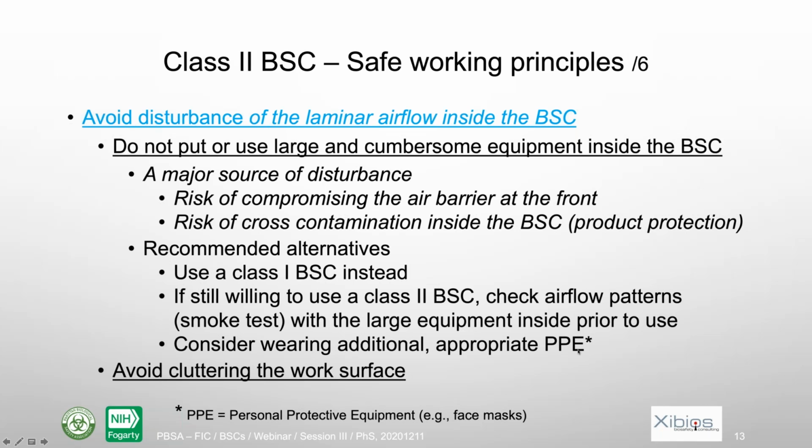If that is the case, you should really consider wearing some additional personal protective equipment, like a mask. If you cannot do that checking, it might be safe anyway to wear a mask when working at the biosafety cabinet.